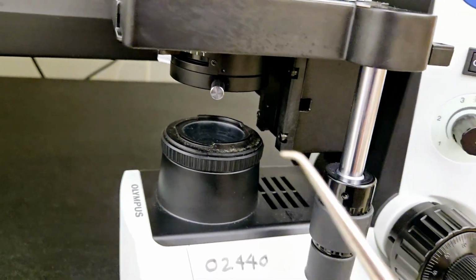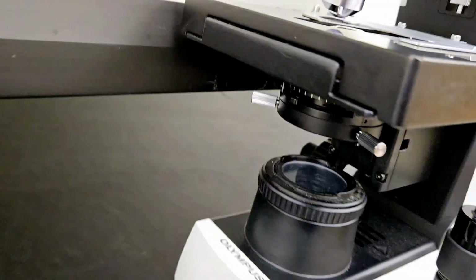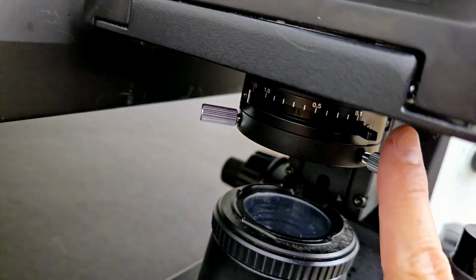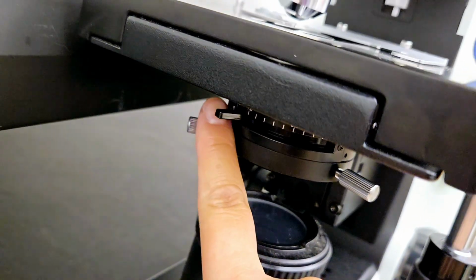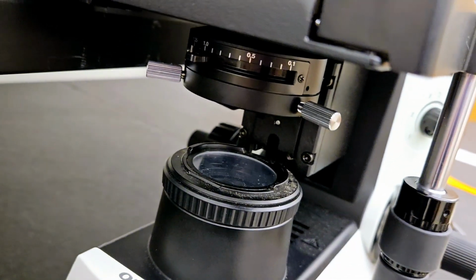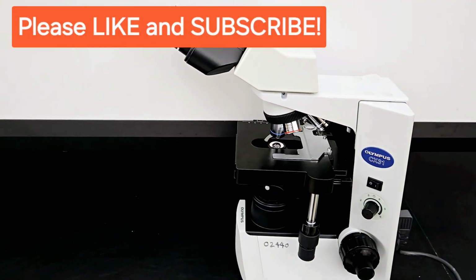Underneath the stage, you have the condenser. That's the condenser right there. This is the substage light. And then inside the condenser, you have this little lever right here. This lever is called the iris diaphragm lever, which closes and opens your field depending on whether you want more contrast at higher magnification. And that should be all for parts of the microscope.